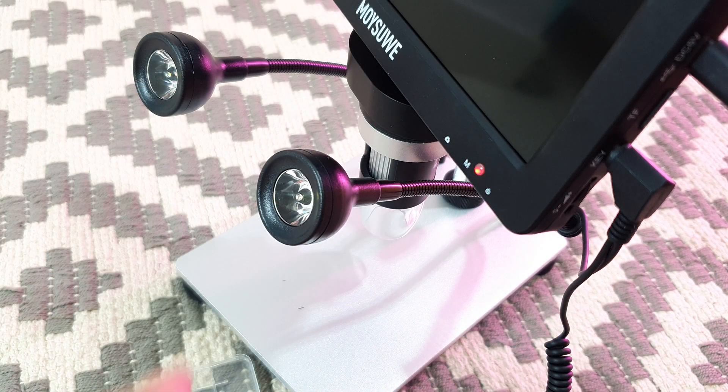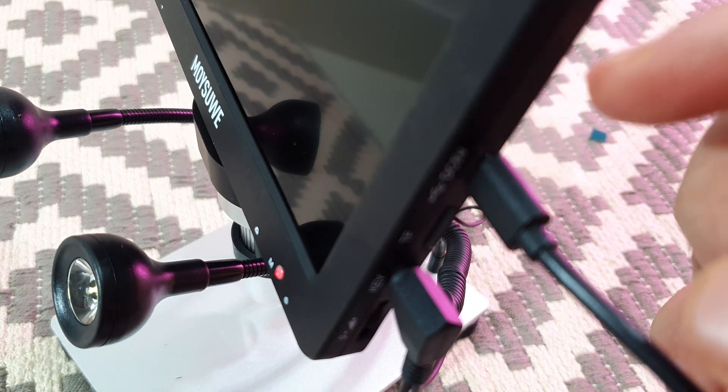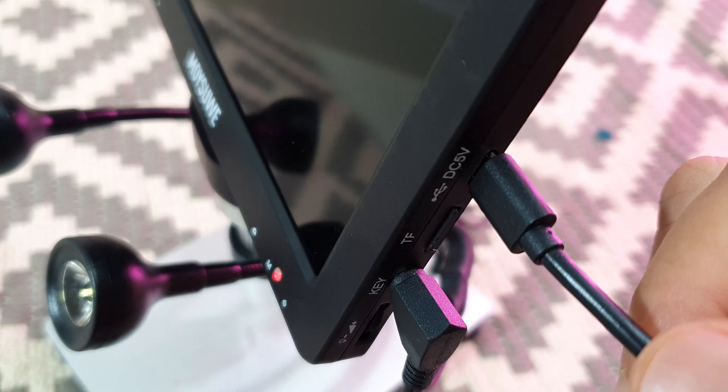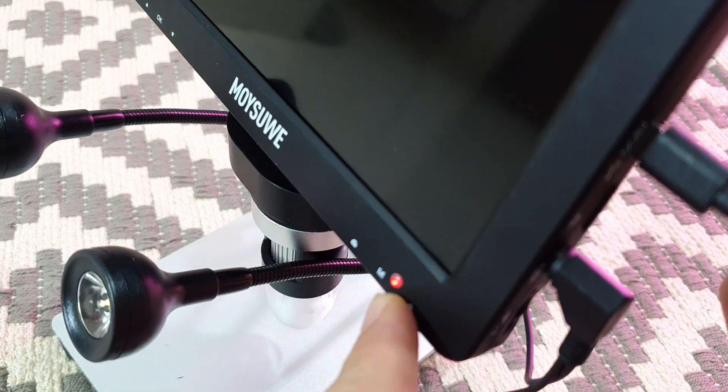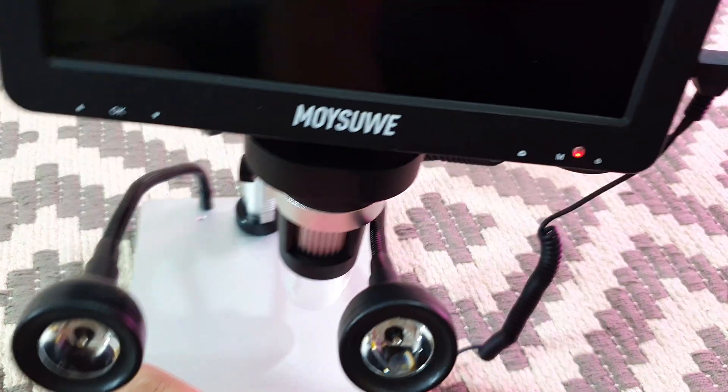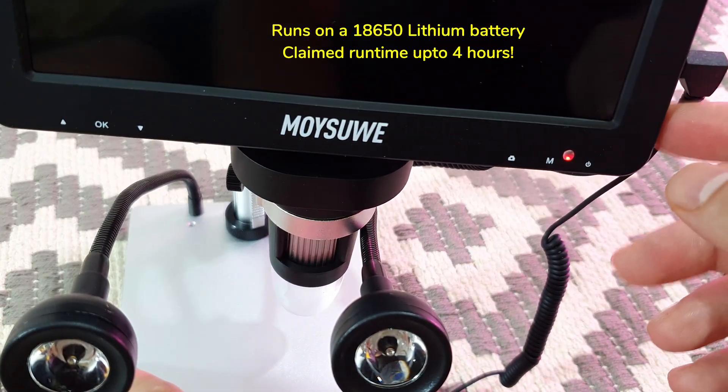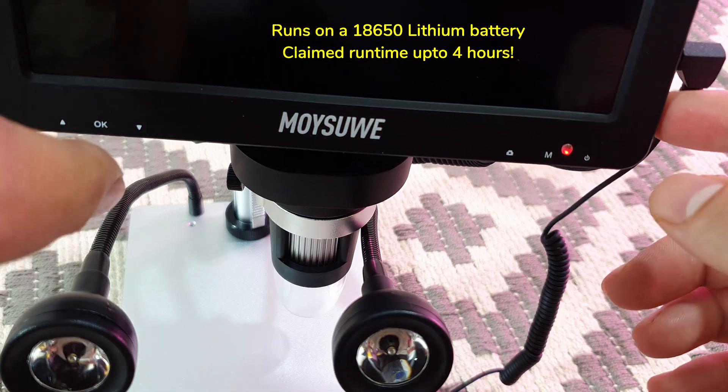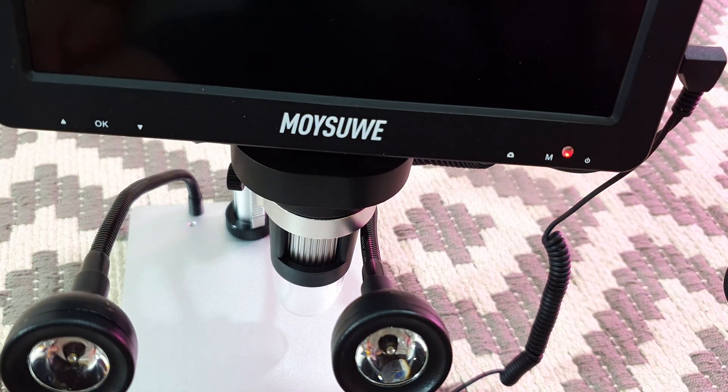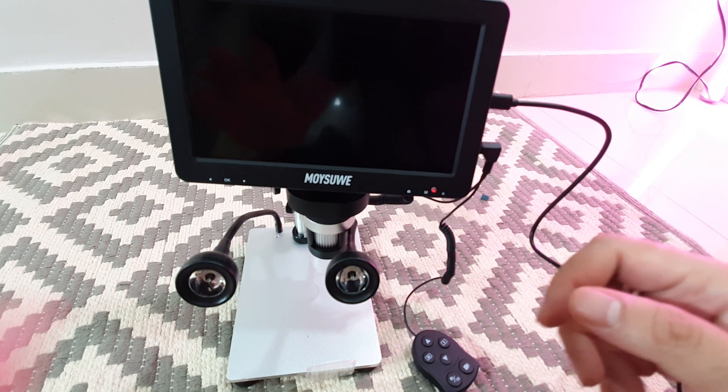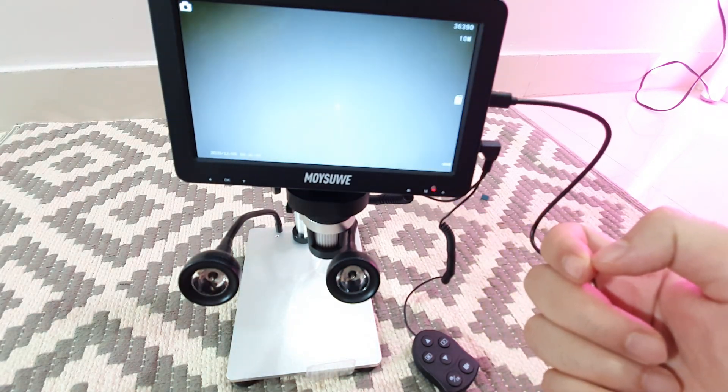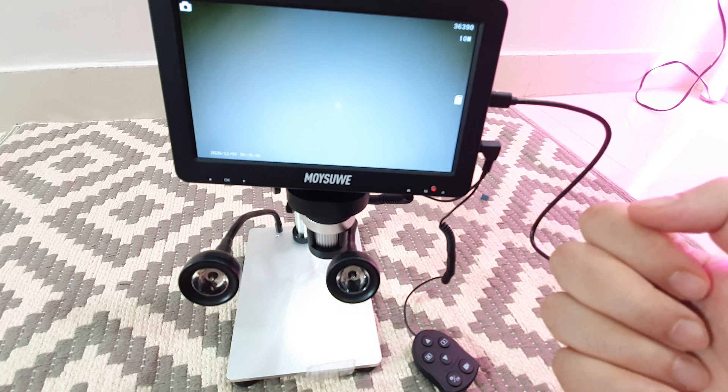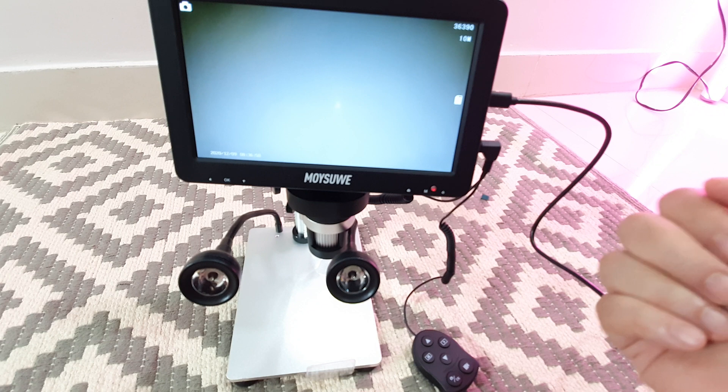I powered this thing up and you can see the red LED there glowing. You need to use a 5 volt supply micro USB, any mobile charger will do. And it's actually indicating that it's charging. It takes about two hours to charge the device fully. There's a power button there, so let's go ahead and click that. There you go, there's a light built in in the microscope itself.